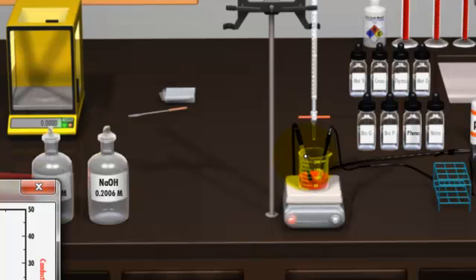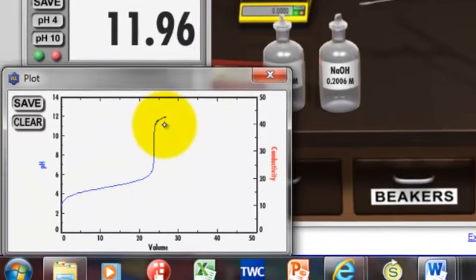That's why you want the palest permanent pink you can get when you titrate. Because really, the base that's turning the phenolphthalein pink is extra. You don't really want to count it. So you want the palest pink you can get so that you know you have added just the right amount of base that totally reacts with the acid.